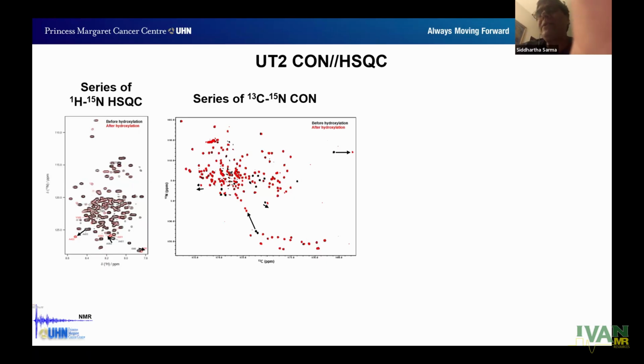Yeah. And may I ask another question? The PHD2 enzyme, did you clone and express that enzyme? Did I clone? Do you have a clone for that to express the enzyme, the prolyl hydroxylase? I would have to double check with the group whose project it is.